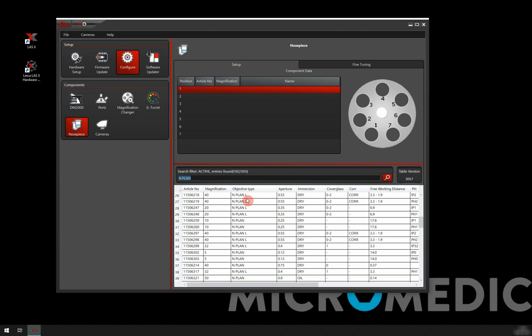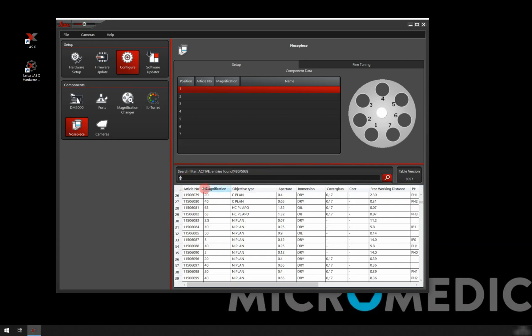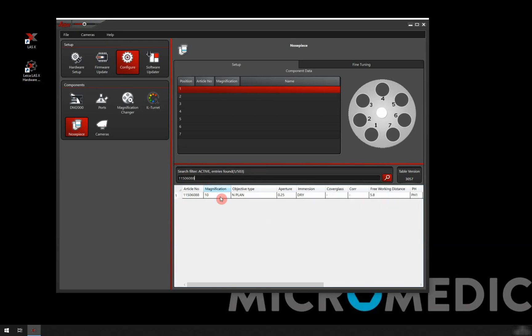Also, if I know that I have my 40x magnification, I just type 40 and I get all of them and I can search. But if I have an article number, I can simply put that in. For example, for the 10x objective, I have the N Plan 10x objective. So I can just type in the article number and there it is.